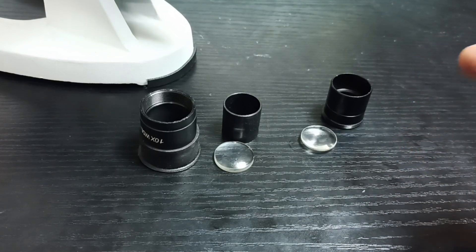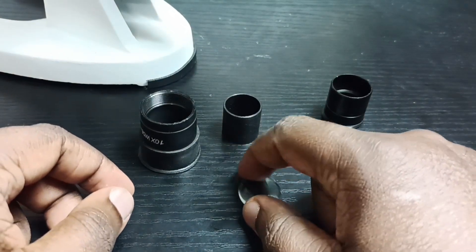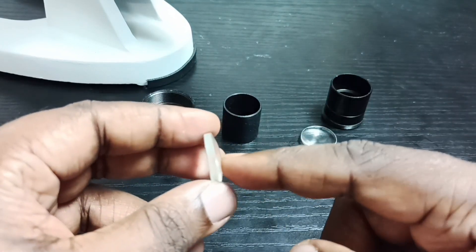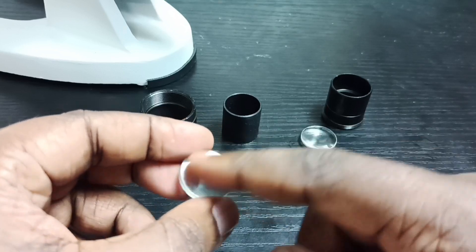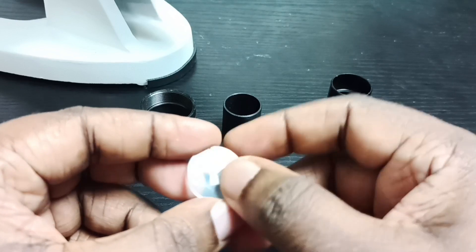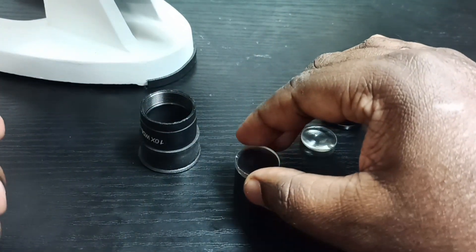First we need to insert the first lens. If you look at this lens, you can see one side has a bulge and the other side is straight. The side which has a bulge — that side you put on top of this plastic tube.